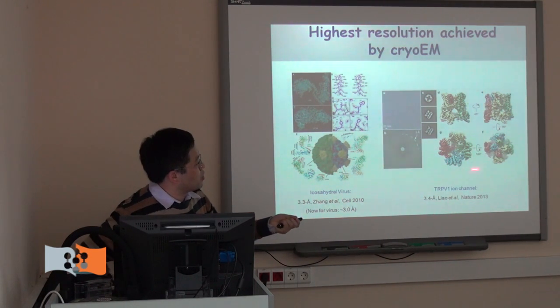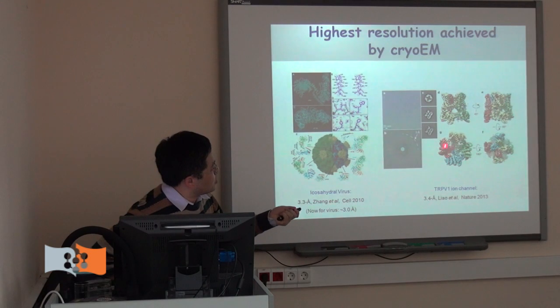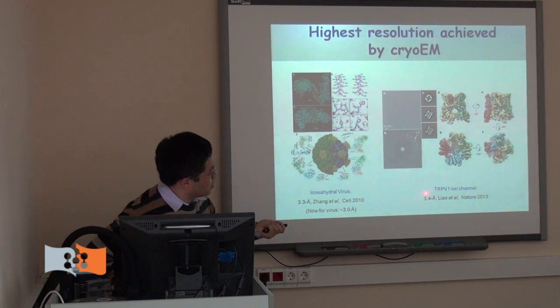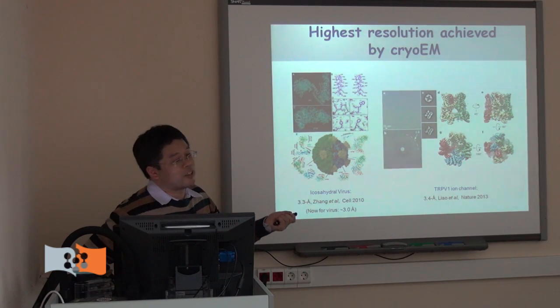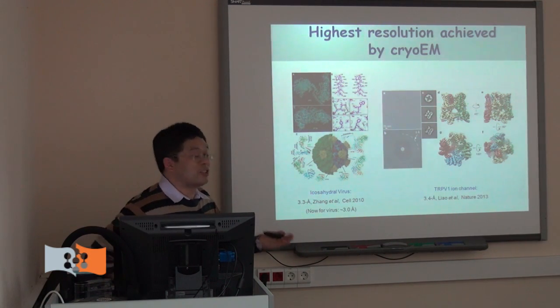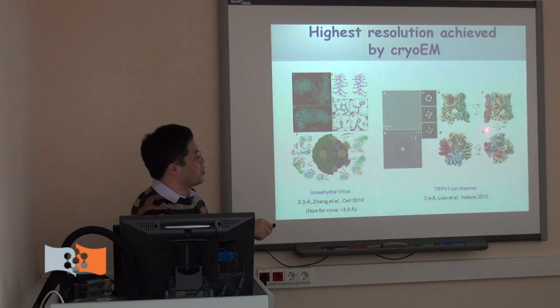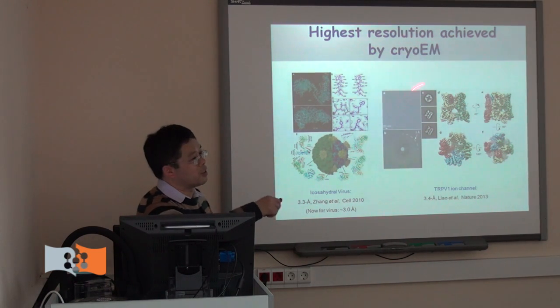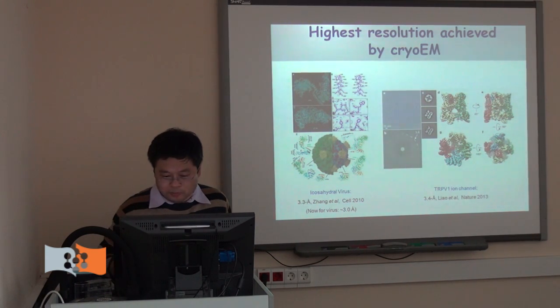For this one, we think this is a breakthrough work. They got a 3.4 angstrom resolution of this channel membrane protein without crystallization. So this means that the cryo-EM field is getting more and more attention, because we can deal with this kind of difficult challenging object. This is a good development.